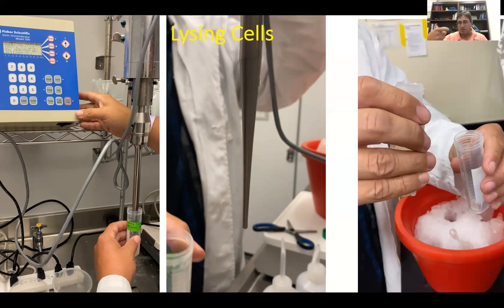Now I'm doing this here so you can see this with my hand holding this. You really should have this on the ice. This sonication, with the vibration and rotational energy that's shot into the solution, will get it very warm, and then you start denaturing your protein. So this really should be done on ice. I did this here as a demonstration model to show you what it would look like and sound like. But again, you take the ice bucket, raise it up, and lower the probe down into the sample.